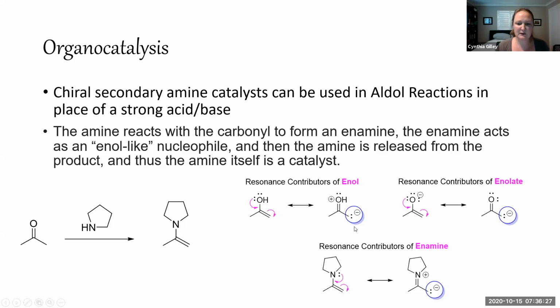But regardless, you can see the similarities between all of the structures here, right? Where an enamine essentially is the nucleophilic component, right? That would replace the need to form an enol or an enolate.